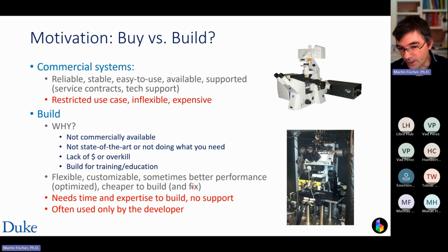Just to give you an example, at a microscope core facility on campus we had a water leak and water dripped on the microscope. And the company came in and said, "Oh, well, we can't fix it. You have to buy a new one." If it had been a custom microscope, we would have replaced the parts that were wet or damaged, and we would be off and running. The company said, "We don't do that. You have to buy a new one." So that's very expensive.